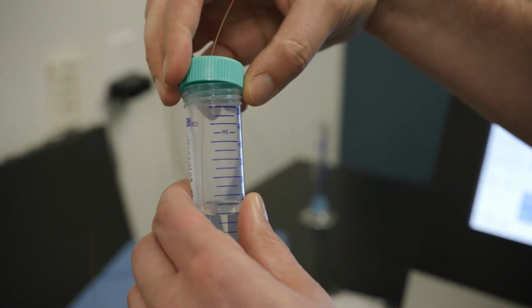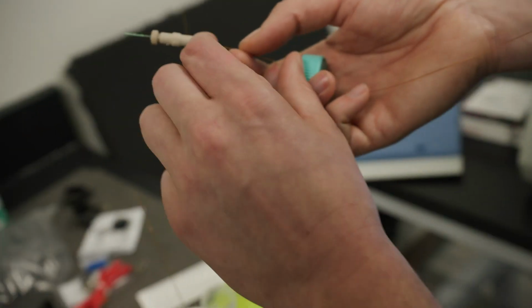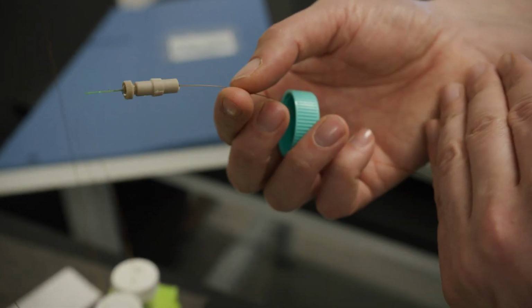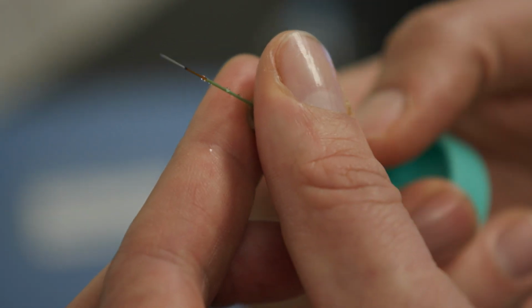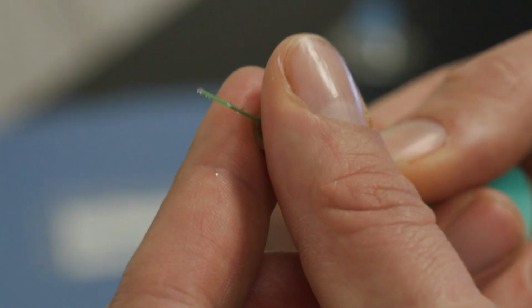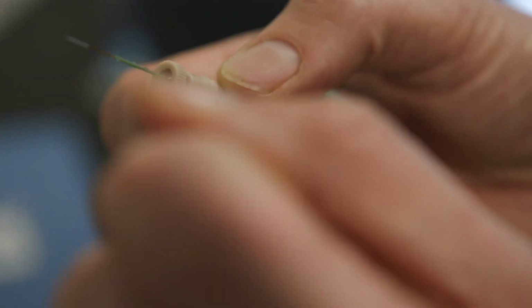Right, so what we're looking at here is, we pack this capillary with C18 material, this hydrophobic material, right? And then analytes come through here, and we try to electrospray them through this tip. This gives us a really sharp tip that will cause the droplets that contain our analytes to get really, really small. And then as we apply a voltage, those droplets will desolvate, and we'll get our analytes into the gas phase.